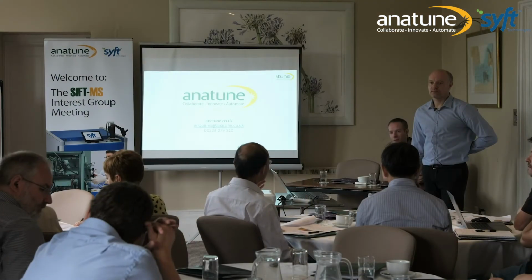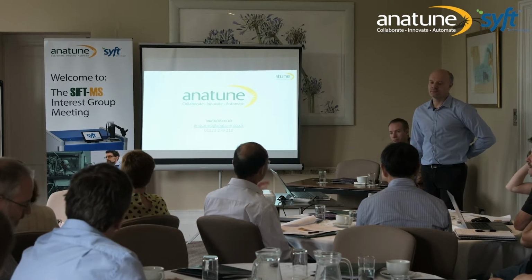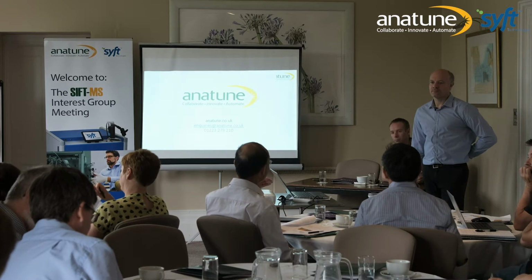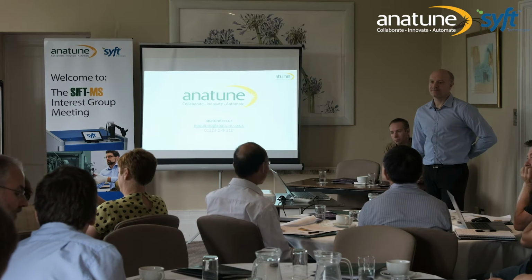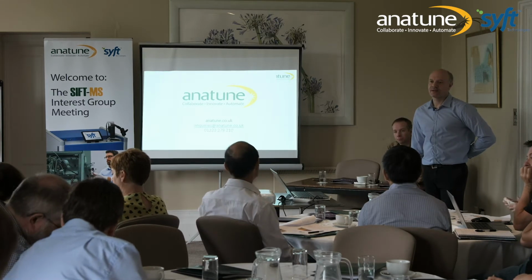In general, I know it is necessary to go through validation for a new method. However, when we want to use, say, an ISO method, AOAC method, or EU method, do we have to do the same?